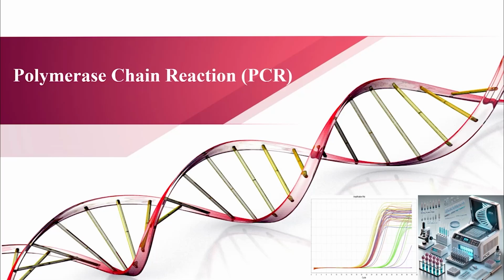Today we will talk about polymerase chain reaction, commonly known as PCR. This important technique has had a major impact on molecular biology by allowing scientists to amplify and study specific DNA sequences. Throughout this presentation, I will explain how PCR works, its application, and its significance in different fields.